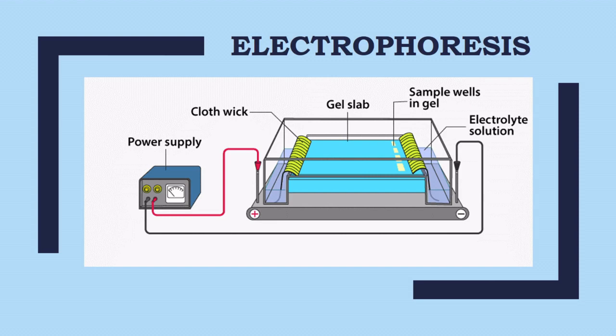Unlike DNA, which is naturally charged negatively, so it runs towards the positive electrode, in proteins we have to impart charges using SDS, and then we make them run along the polyacrylamide gel. Because of the charges we get the separation. Also, because of the molecular weights and their capacity to run through the pores in the gel, we get the separation of the components.